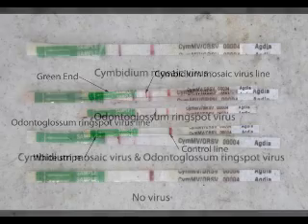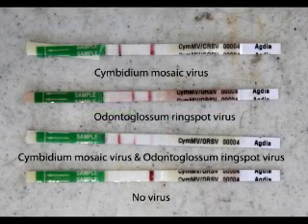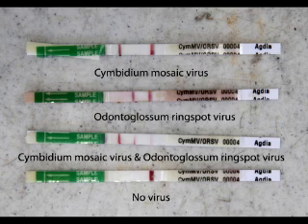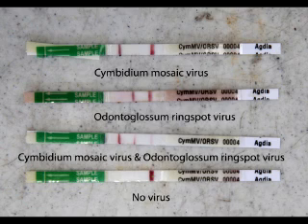Let's go to an image showing the possible combinations that test strips can show. The first strip shows cymbidium mosaic virus — the first possible red line — and then the control line. The second strip shows the odontoglossum ring spot virus line, which appears between what would be the cymbidium mosaic virus line and the control line. The third strip shows both cymbidium mosaic virus and odontoglossum ring spot virus along with the control line. The fourth strip is showing one we all want to see — no virus and a strong control line. Remember, without the control line you do not have a valid test.